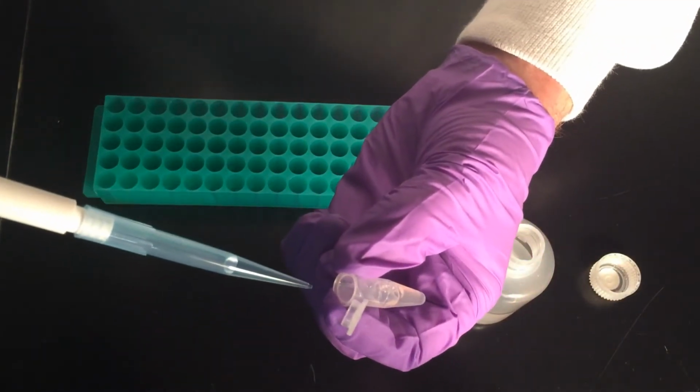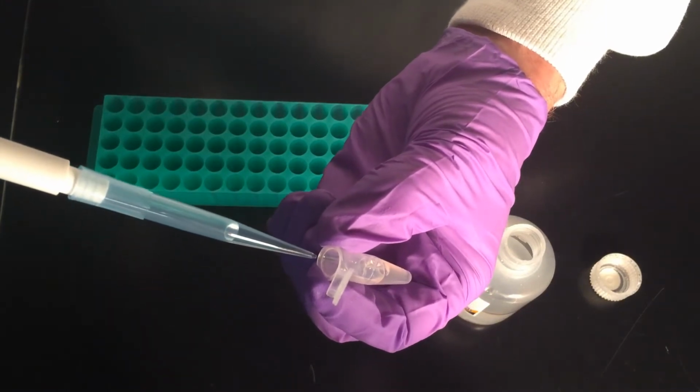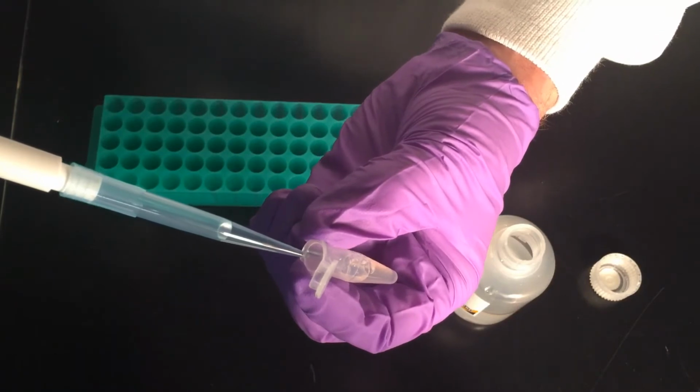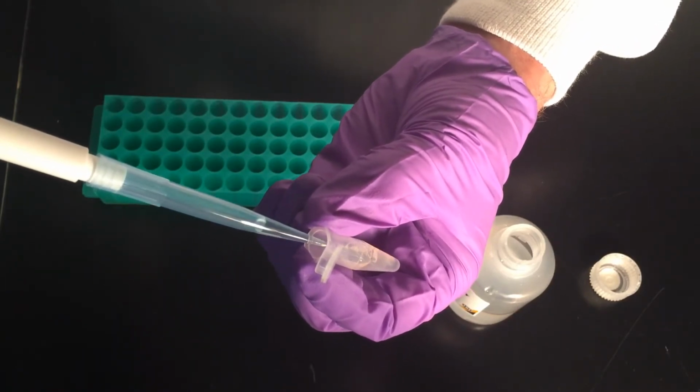So if you watch here, I'm going to add the PD3 buffer, and you should see the precipitation of the DNA and the proteins start to happen right away, although I am going to incubate this on ice for 5 minutes.